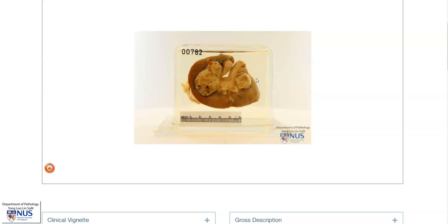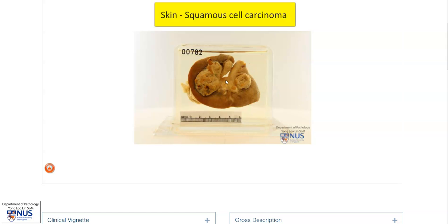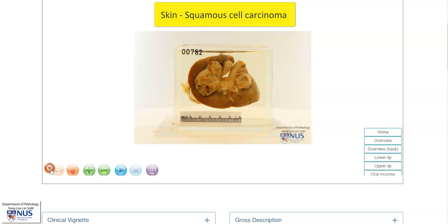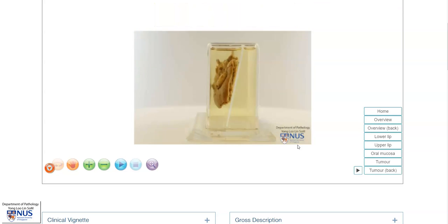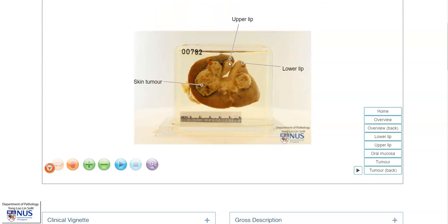Hello, this is a virtual pathology specimen of an example of squamous cell carcinoma of the skin. Let's orientate ourselves. This is actually arising in the face at the angle of the mouth. We have the upper and lower lips here, and this is the irregular tumour in the form of a nodular mass on the skin surface.